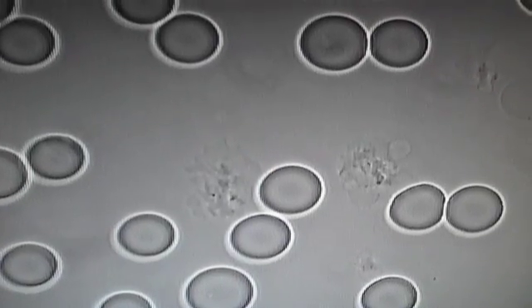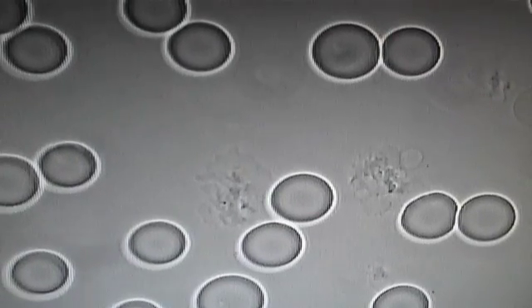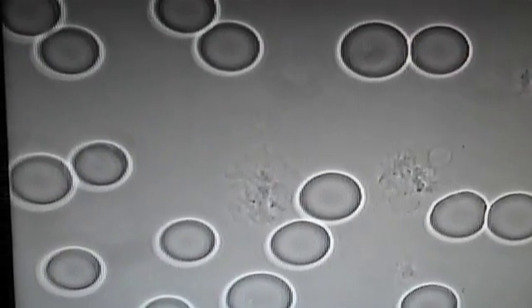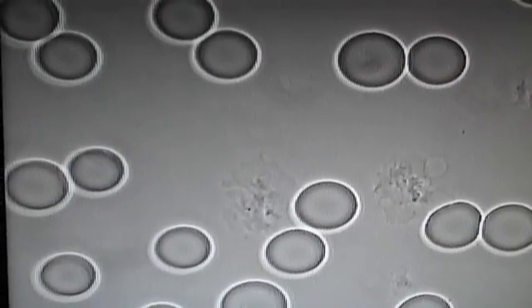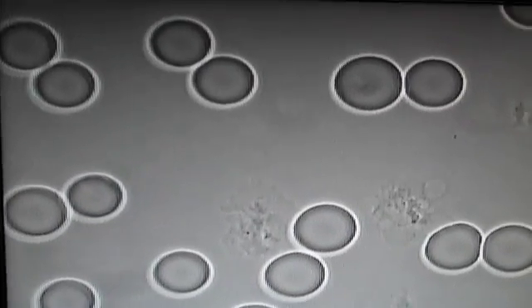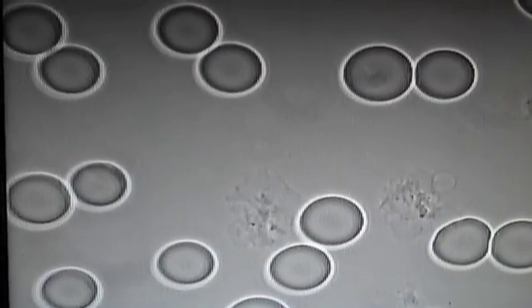So here we have the blood sample of a client who has some inflammation problems. We have good quality red blood cells, but we've got the presence of yeast.